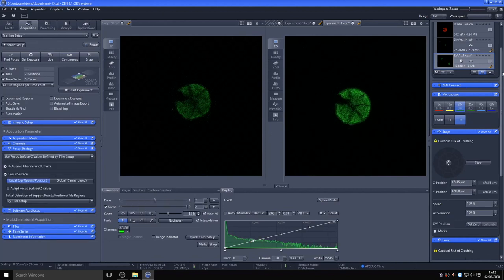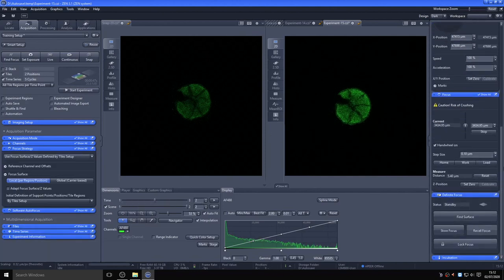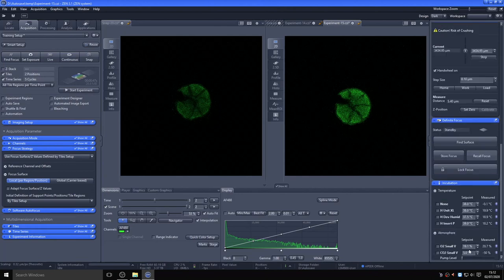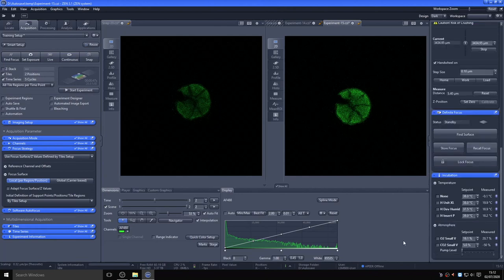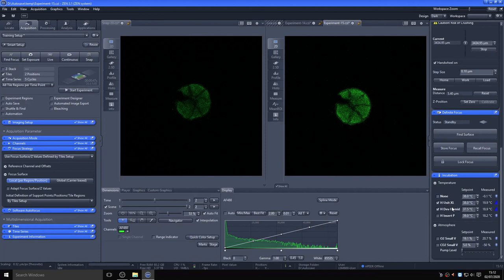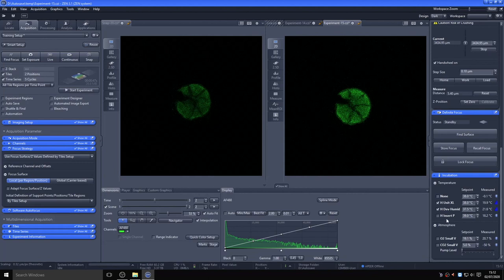Obviously, to maintain physiological conditions suitable for your cells to grow, we need to ensure the microscope system maintains correct temperature and CO2 levels. These can be set on the incubation tab on the right-hand panel, with calibrated temperatures being taken for different components to keep your samples at 37 degrees and 5% CO2, for example. So be aware that the set points may not be set different than what you would be requiring. Please discuss with us your imaging needs. We can help to enter the correct settings for your sample setup to ensure that your samples are imaged in physiologically appropriate conditions.